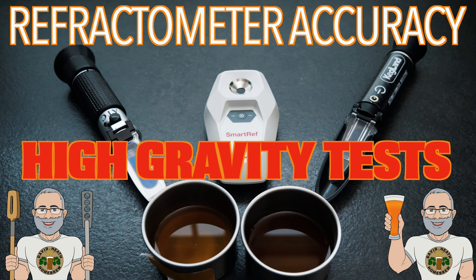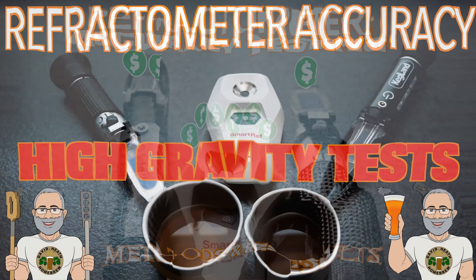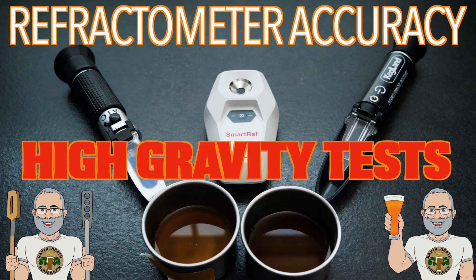Within this video I will be accuracy testing with three different refractometers that come in at three different price points. This video is very much a follow-up to a recent test video, as shown on screen now, that tested one sample that was quite low in gravity. If you have not seen the first video, I recommend you do so first before watching this follow-up, as there is much information contained in that one that will not be repeated in this one. This time I have two different samples that came from a high gravity brew that I completed recently, so let's get started.